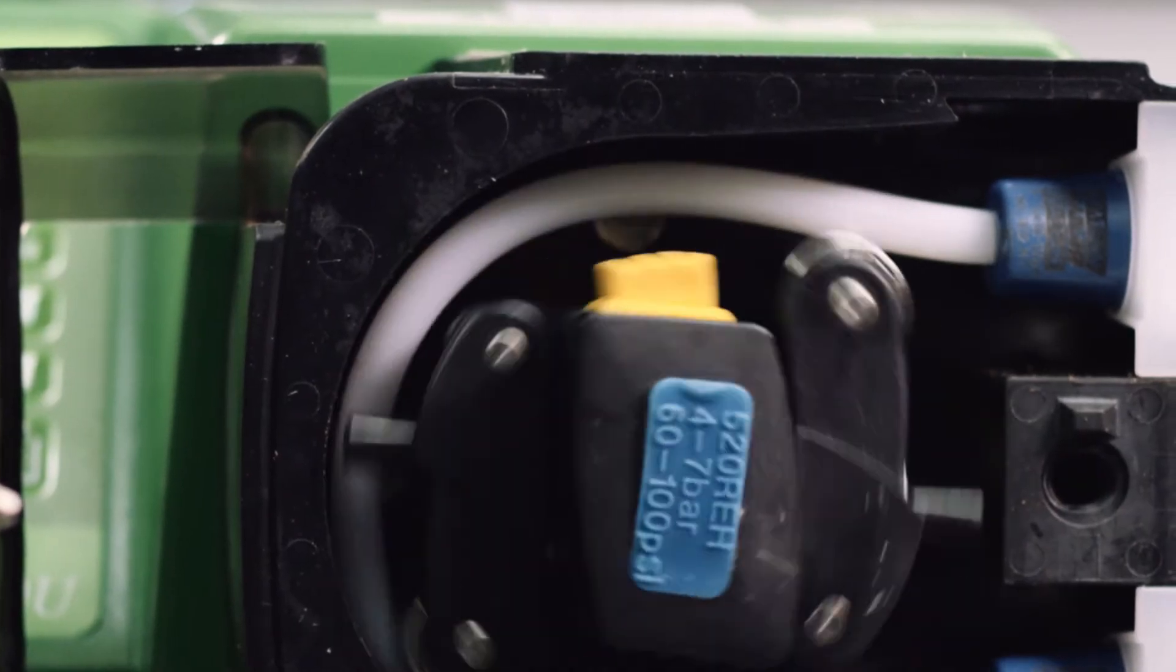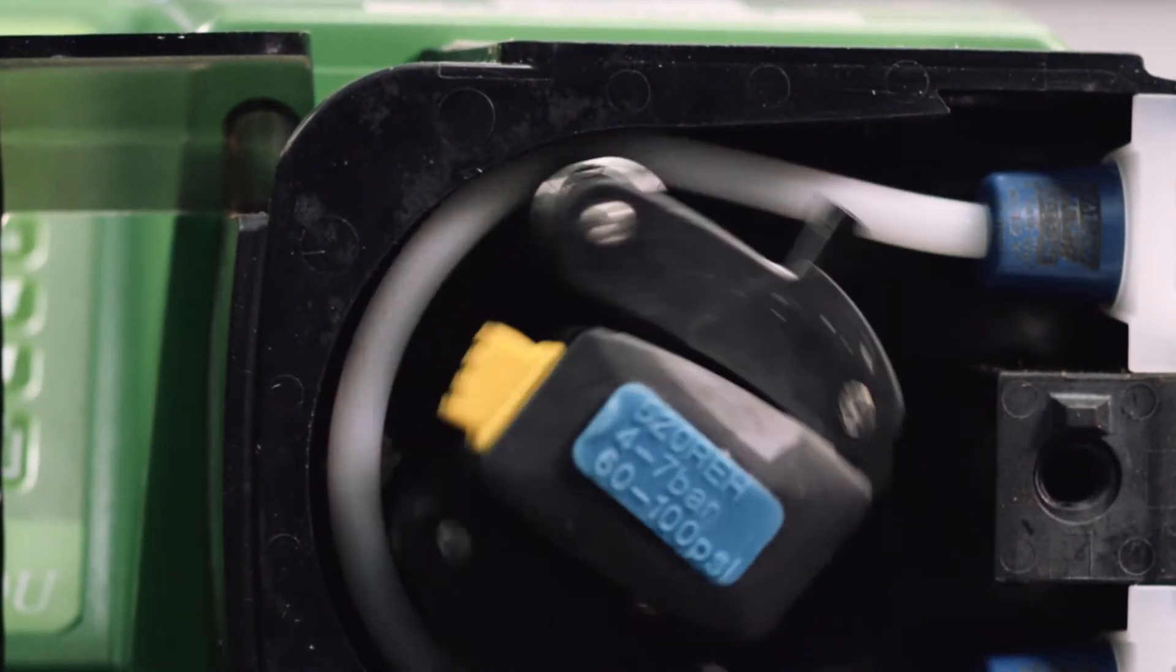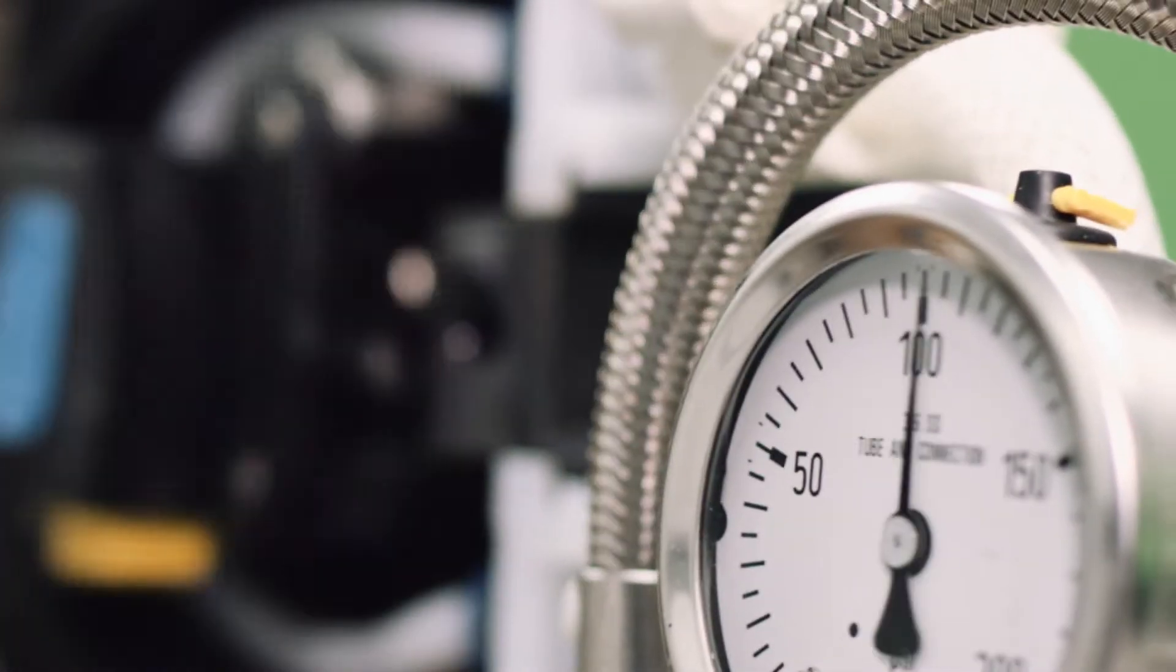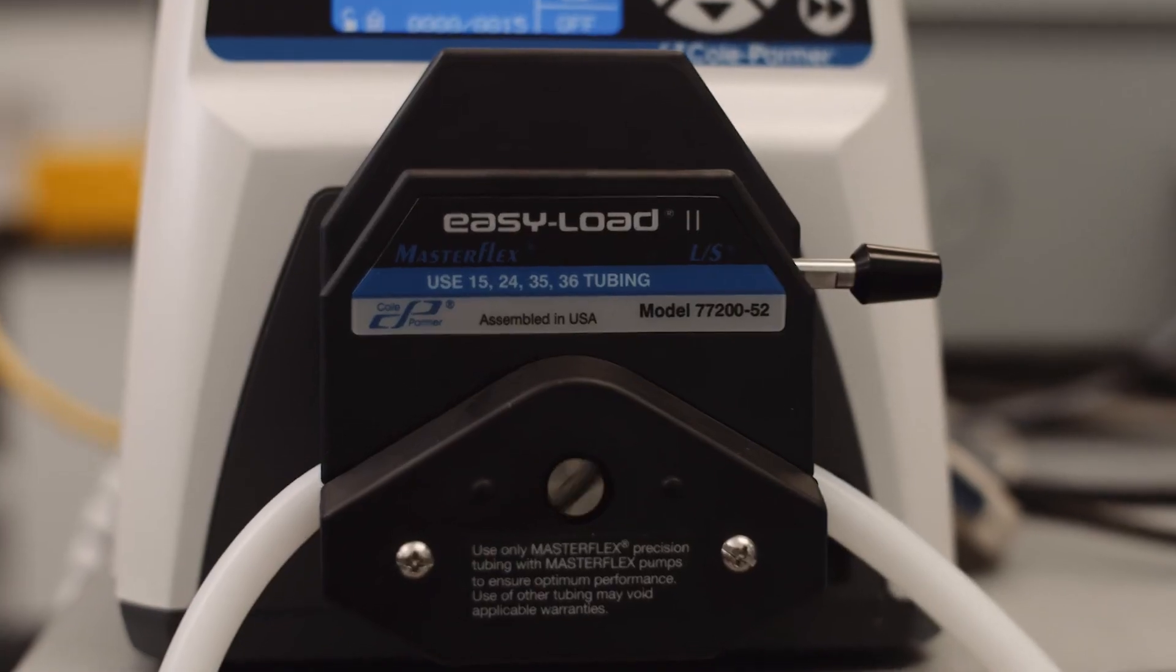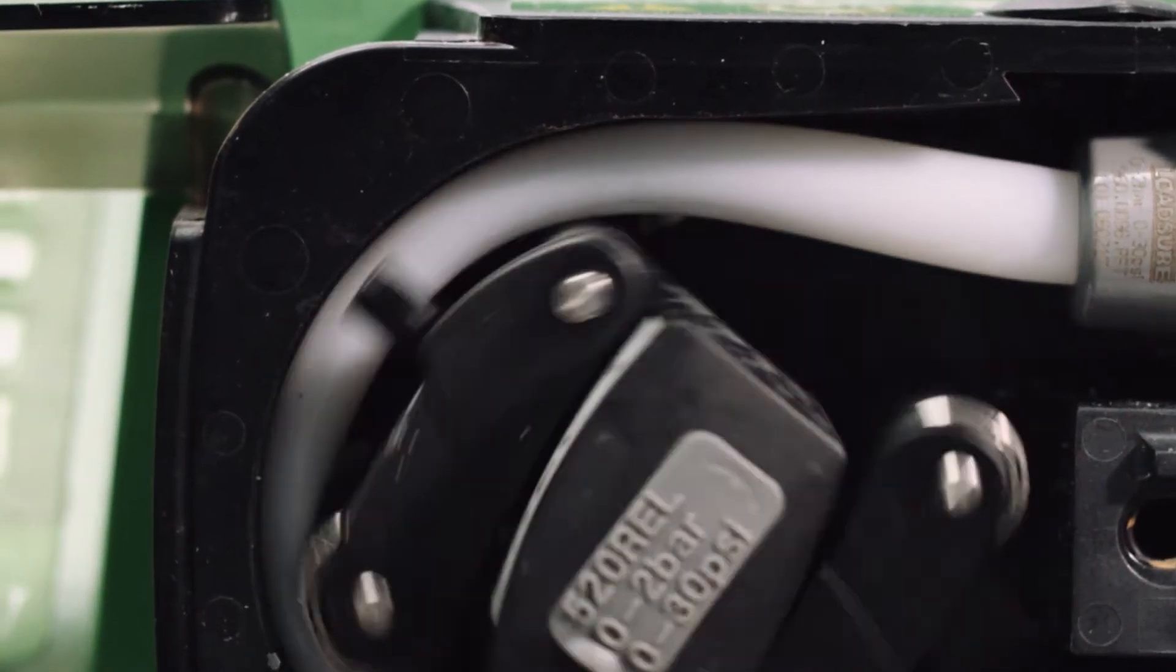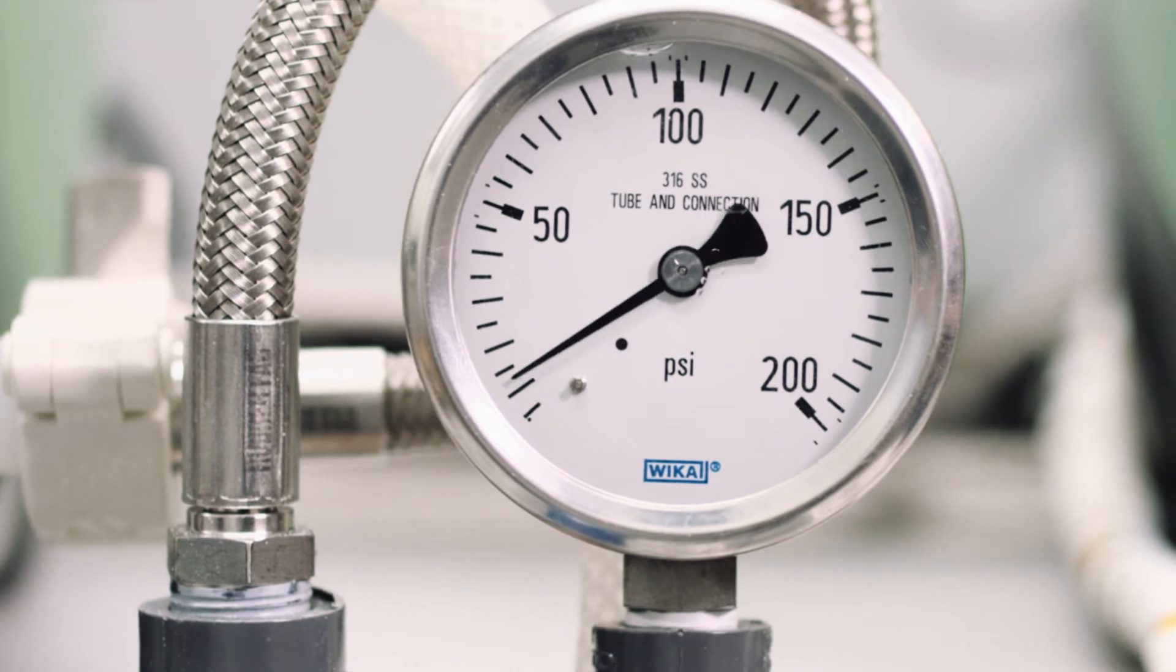You can trust Gore's Stay Pure Pump Tubing at high pressure conditions. It is also great for long production cycles at low pressure. Its highly resilient structure delivers consistent flow time after time.